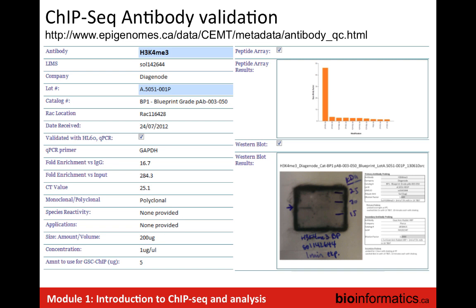What should be the read length for paired end and single end? So again, we know at 75 base pairs, we're mapping most reads uniquely, at least in the human genome. I'm going to stick to the human genome. But really, this is now more predicated by the vendor. This is more of an Illumina issue. Most of us use Illumina sequencing, right? It's pretty much the dominant platform. And their reagents are kitted in paired end 150s or whatever. The flexibility in terms of read length really isn't there much anymore, at least in my experience, and I think that's going to become even more the case.